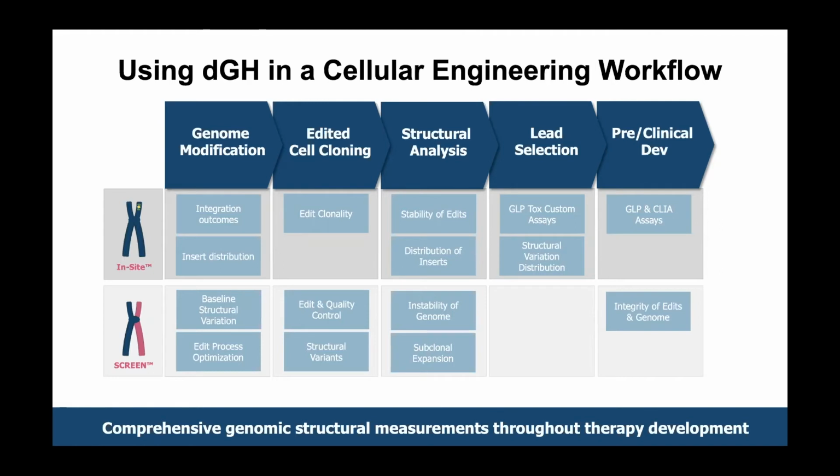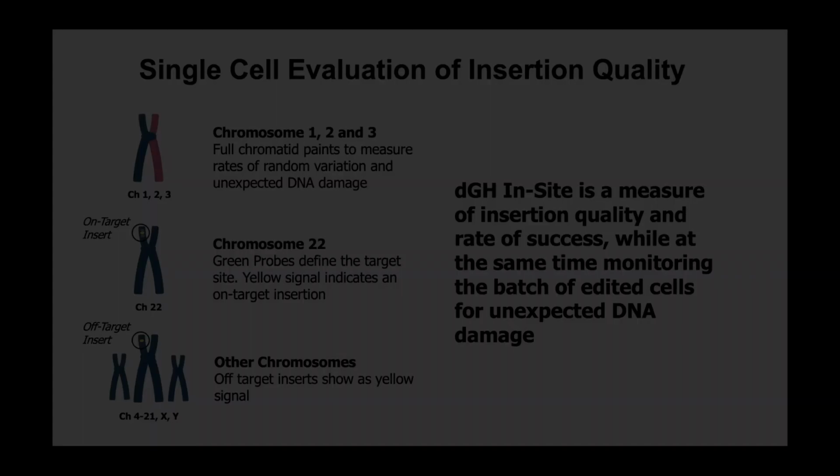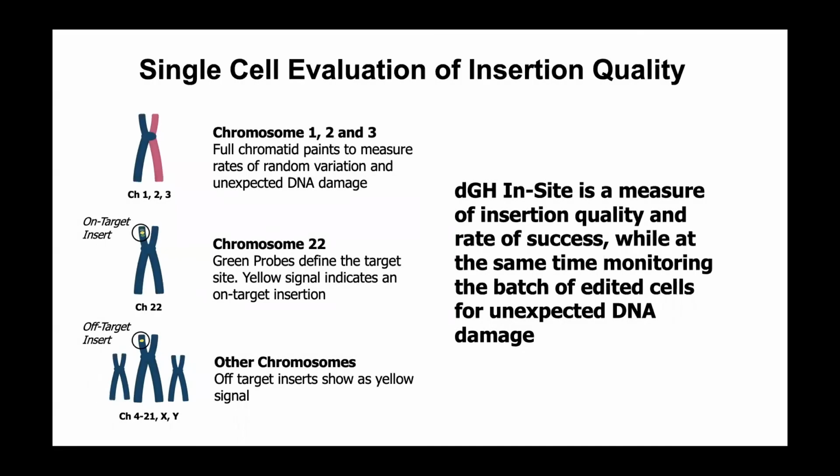and as a measure of editing integrity, a structural QC test if you like, demonstrating batch-to-batch robustness of the editing outcomes and control of the editing or insertion processes. A real-world example of how this is applied is in the quantitation of inserts used, for example, in editing or in the production of transgenes.